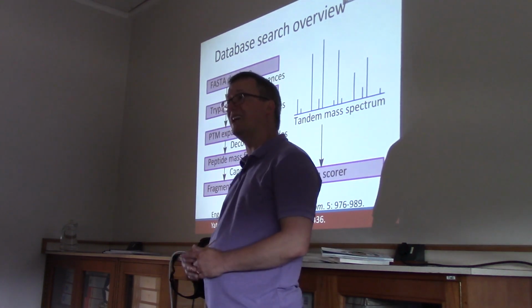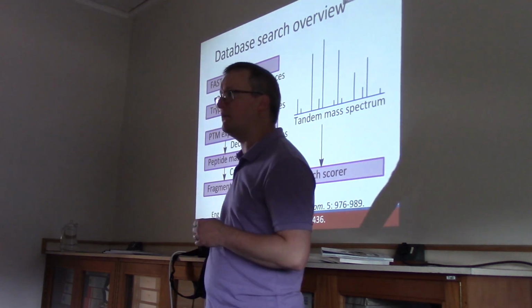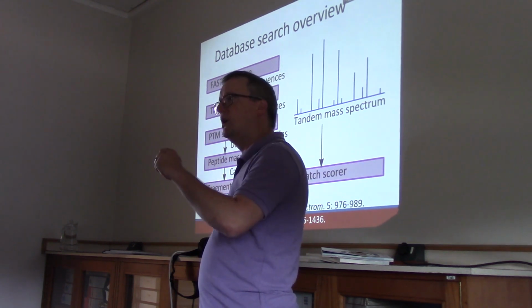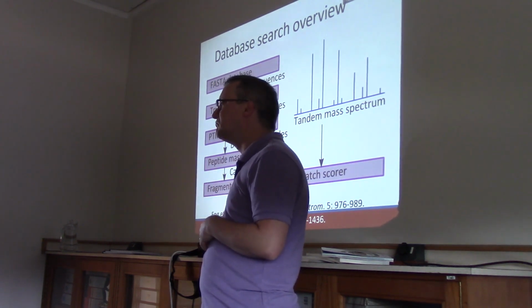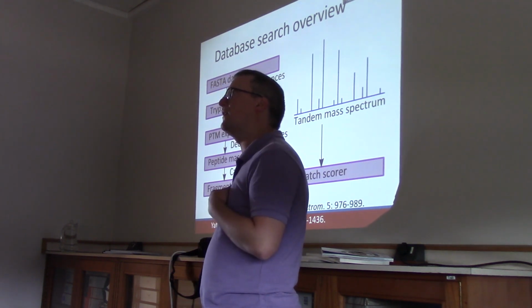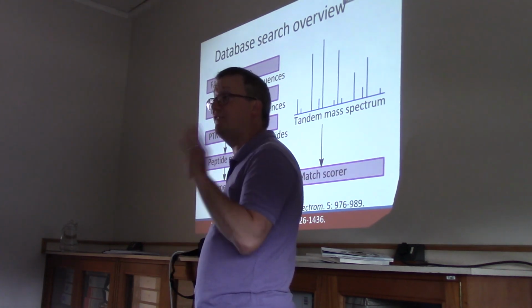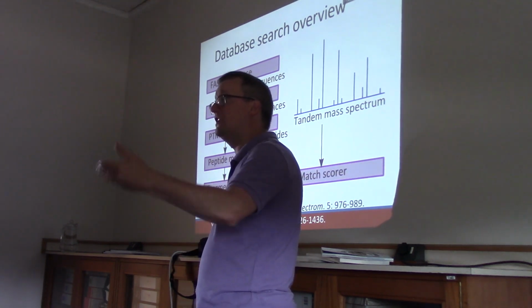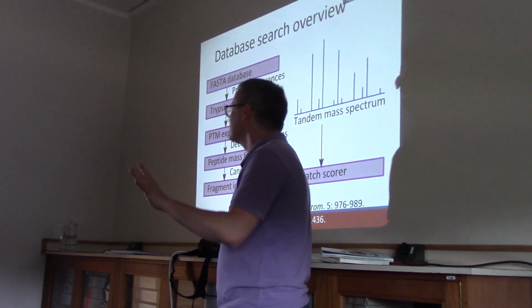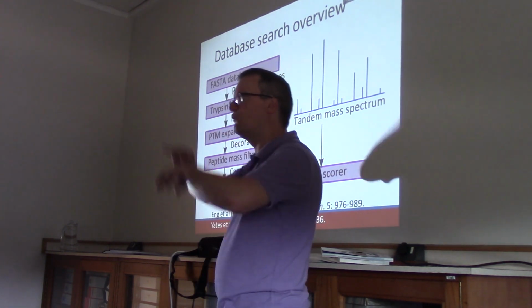Generally speaking, if you're doing clinical proteomics, you're going to use a FASTA sequence database that contains every protein sequence that we know can be found in humans. All right, and generally that's just going to be the reference sequence. So if you have a valine rather than a leucine at some position in a given peptide, you would fail to identify that if your sequence didn't match the canonical sequence database. Generally, we ignore that. So we start with maybe 100,000 protein sequences for human.